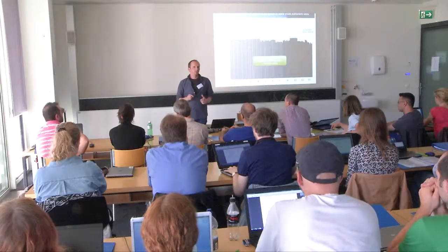So the original paper, it was 25 m/z times 32 windows. And somebody mentioned earlier that AB Sciex has this variable window setup where you basically size the windows based on the density of the signal. So now in the lower mass range, around 500, 600, the windows are like 8 m/z wide. And up at 1100, they're almost 100 wide. And there's 64 of these windows in our standard method. So we went from 32 windows times 25 m/z units to 64 windows in our standard method, and it varies from 8 up to 90 or something like this.